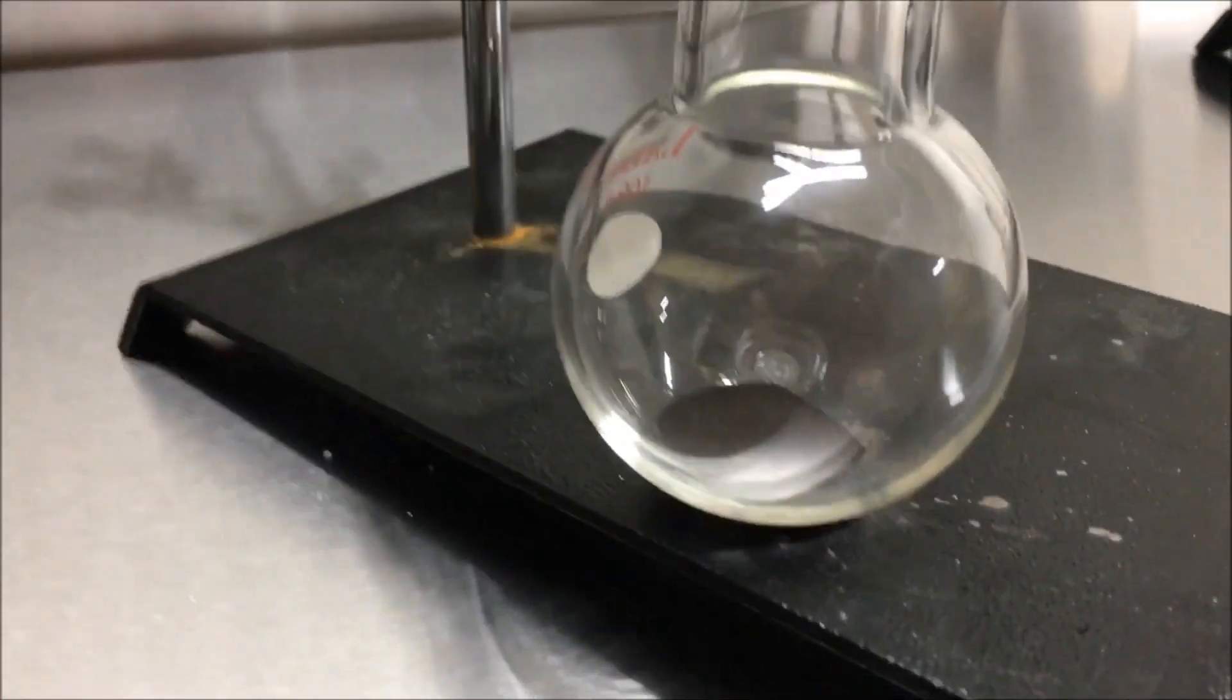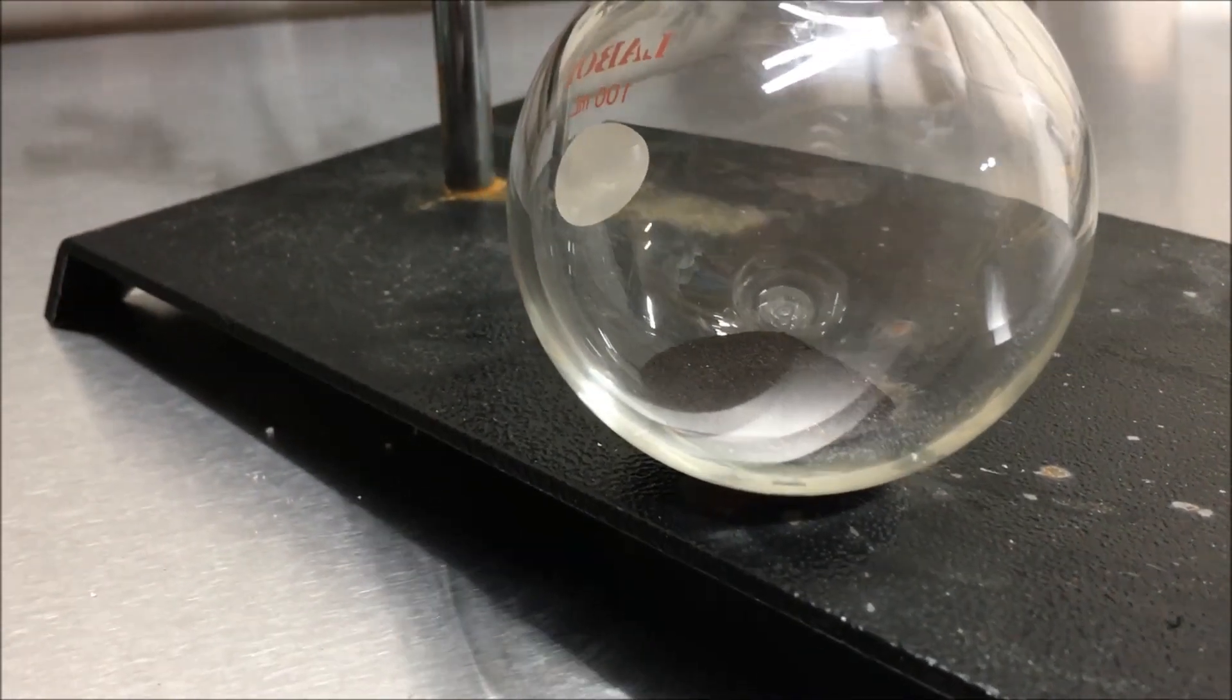Okay, here we go. I'll slowly drip in the hydrogen peroxide into the potassium permanganate.